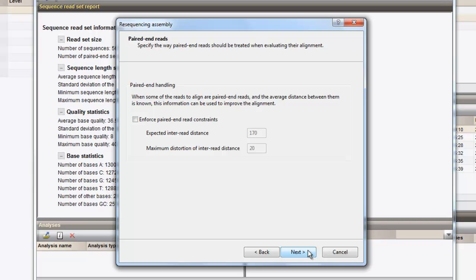This page queries for specific information on paired-end reads. Paired-ends are typically used to optimize the assembly in regions with repeats larger than the read size. When paired-end sequences are used in a resequencing experiment, more information on the inter-read distance can be specified. However, for this example, only single-end data is used, so these settings will not be taken into consideration as no paired-end data will be detected by the assembly algorithm.